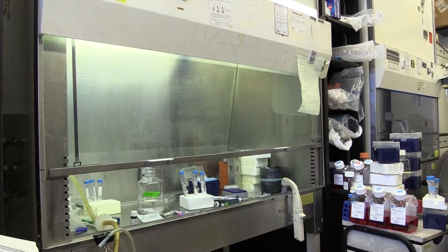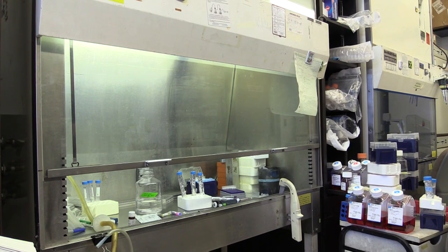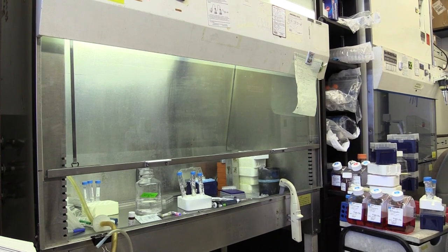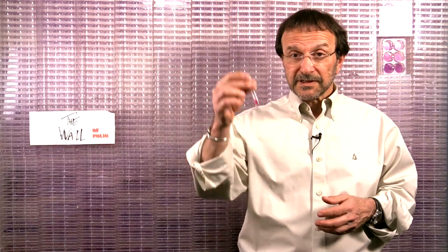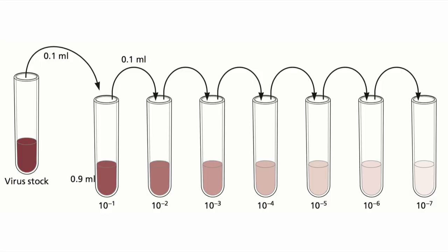Let's now take a look at how a plaque assay is really done. We do plaque assays in a cell culture hood, which provides an aseptic environment to keep our cells sterile. Starting with a sample of virus, we make tenfold dilutions by adding 0.1 ml of our virus stock to 0.9 ml of medium, mixing, and then repeating.